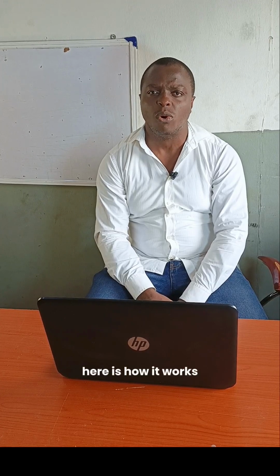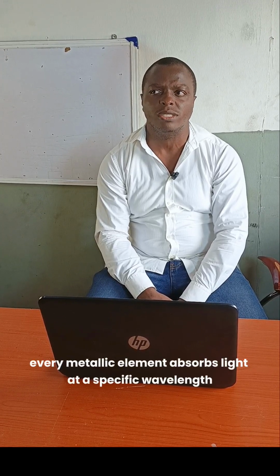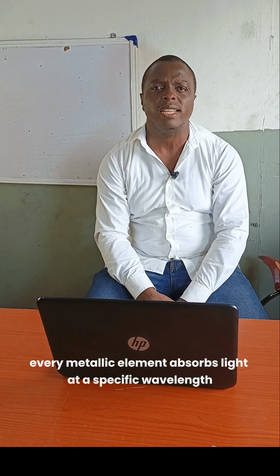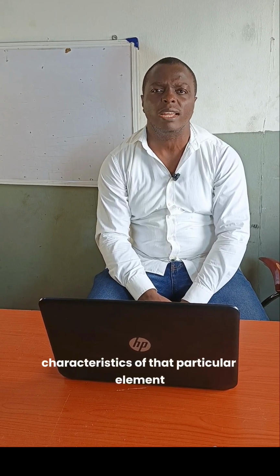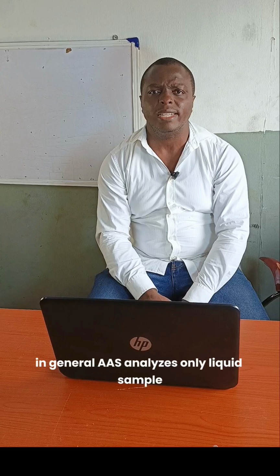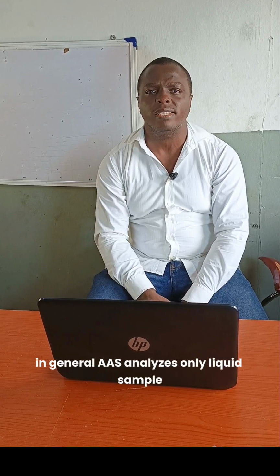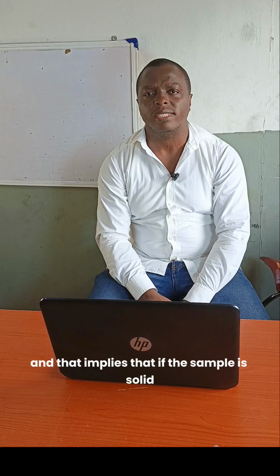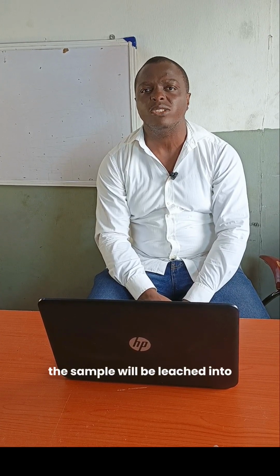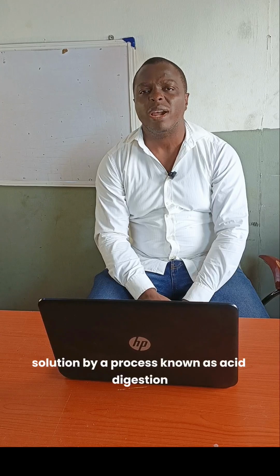The basic principle of AAS relies on the absorption of light by free atoms at ground state. Here is how it works. Every metallic element absorbs light at a specific wavelength, characteristic of that particular element. In general, AAS analyzes only liquid samples, and that implies that if the sample is solid, it will be leached into solution by a process known as acid digestion.